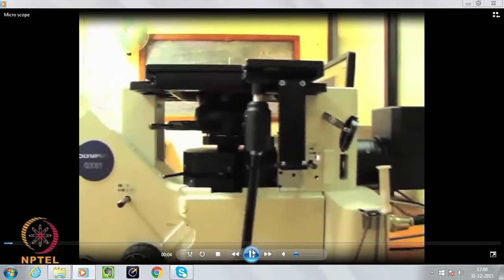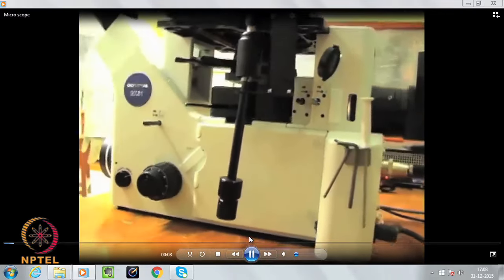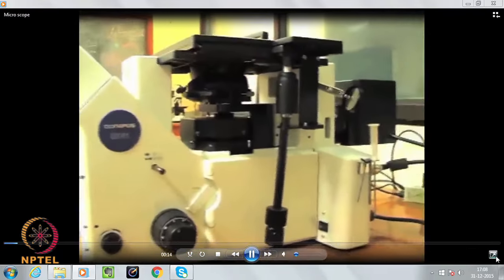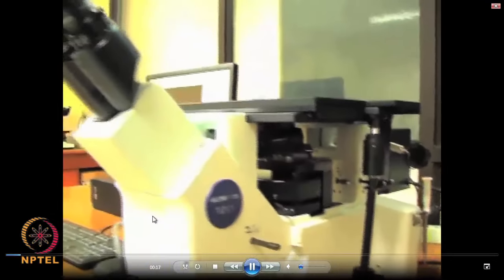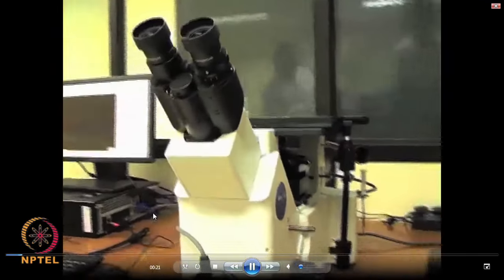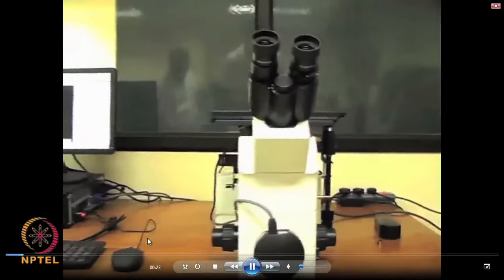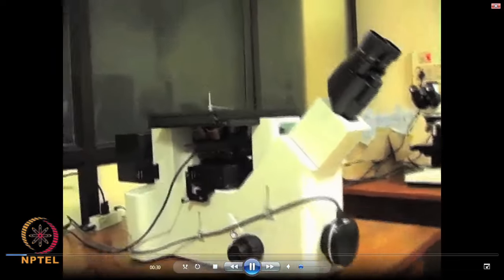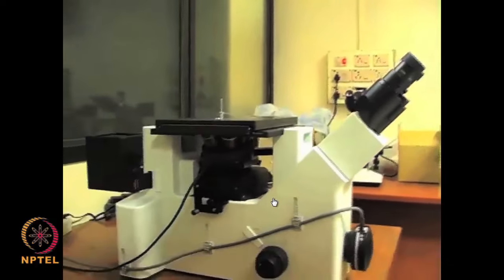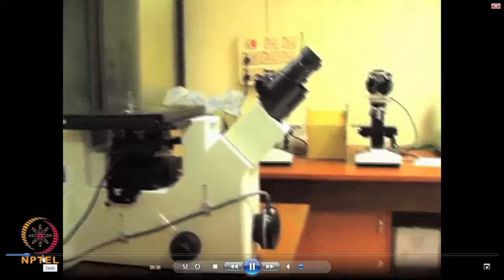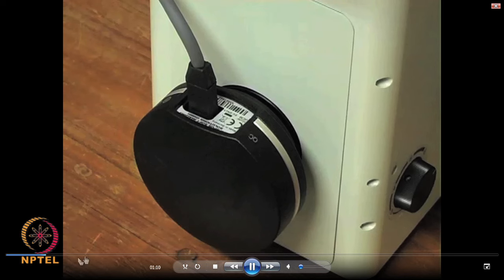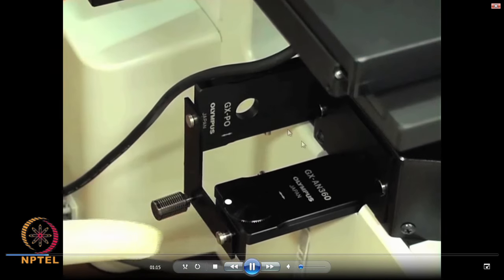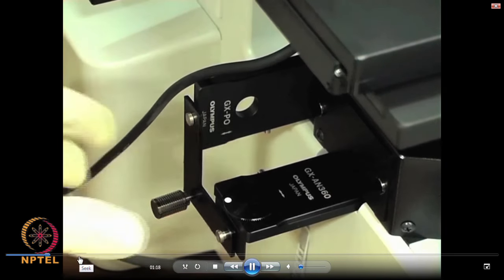The first one I introduce is the metallurgical microscope, which is an inverted type. I just want you to have a feel of how this equipment looks. Then we will slowly get into the details of the parts as well as the operation details as we go along. I also mentioned that this is attached with a CCD camera, with some polarizers and analyzers.